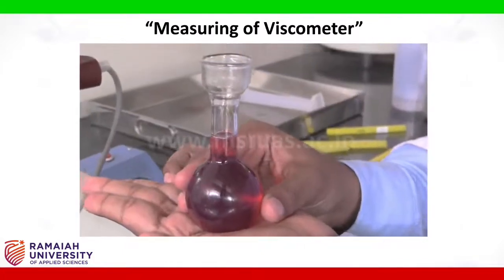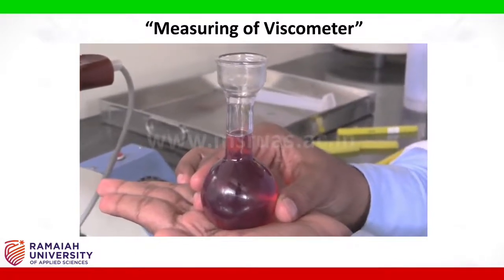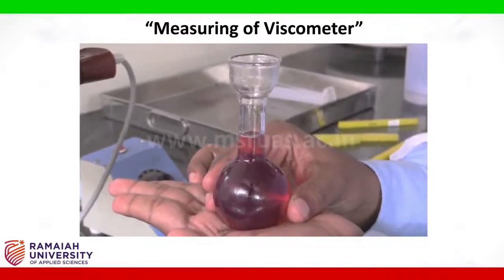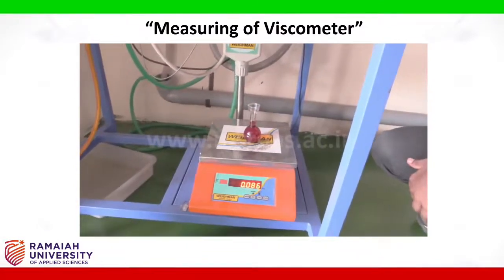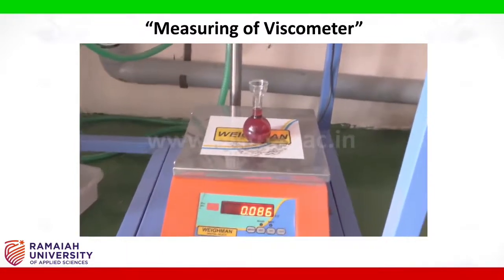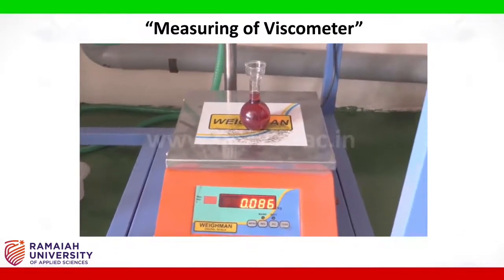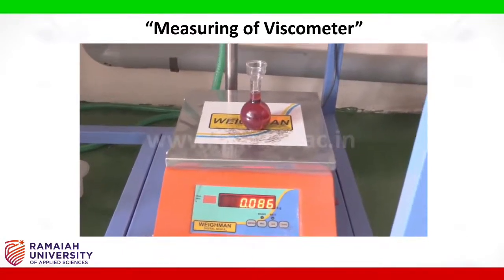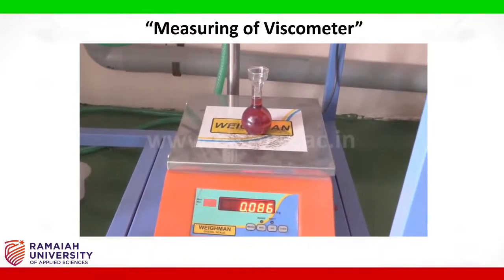Now the oil has been collected in the collecting flask, which measures exactly 60 ml. Let us go ahead and measure the weight of the oil. The value of the oil along with the flask is showing close to 86 grams. By taking the difference of this value with the previous value of the empty 60 ml flask, we shall get the value of the weight of the oil collected from the Saybolt viscometer.